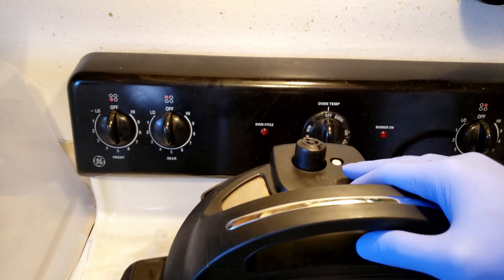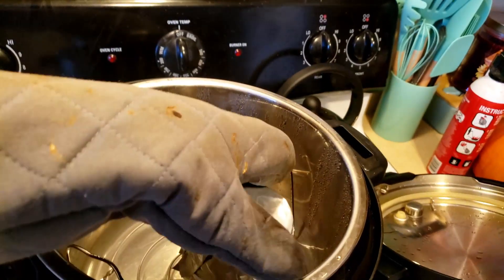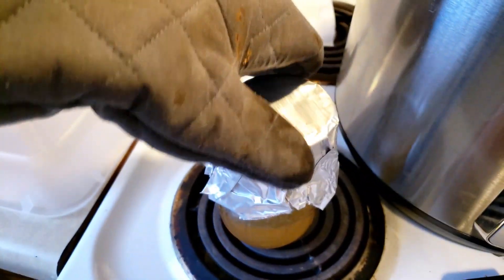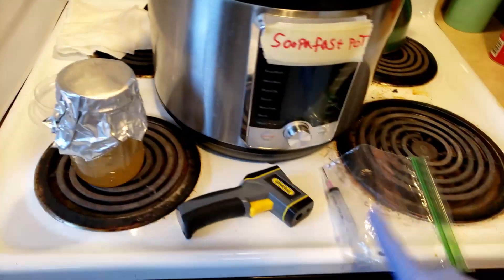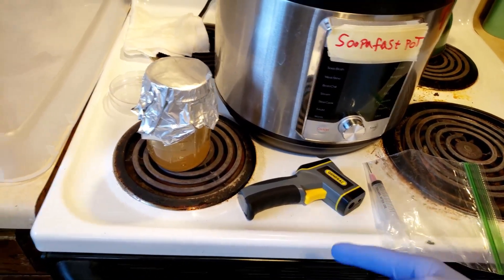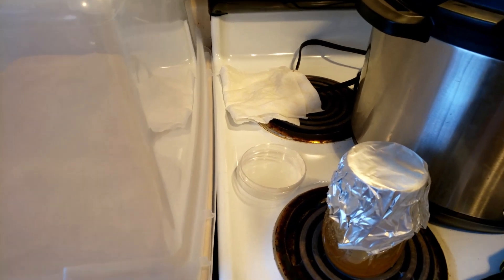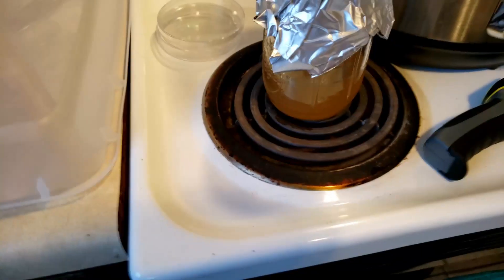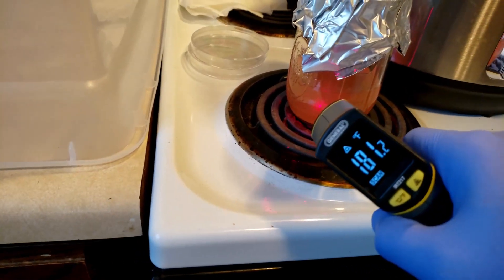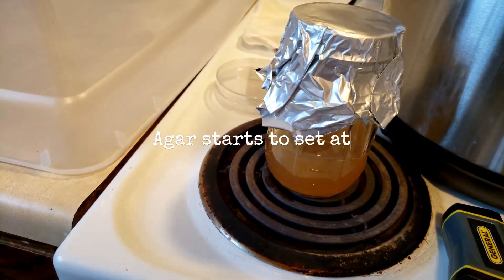Alright, we're back and this is done sanitizing. Our safety latch has gone down so we can go ahead and take our lid off. With a glove we're going to take this out and set it down. I've got a syringe, my temperature gun, some dishes, and slants ready to go in my box. Before I do that I need to make sure this isn't super hot — it's reading 181. So we need to come down about 20 degrees, and then we can start putting this into the slants.